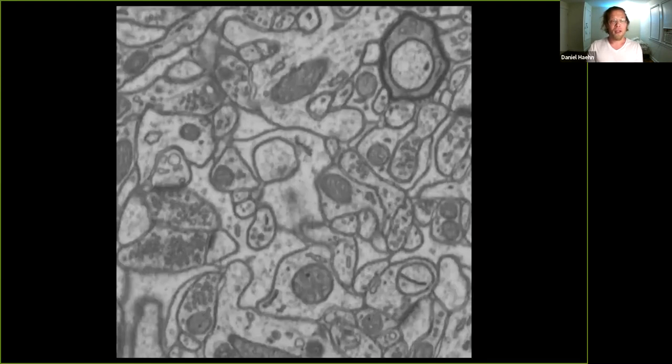With such high-resolution images, we see a wealth of biological information, but we are specifically interested in these dark circular structures that are mitochondria. Here, highlighted in red, with a variety of different shapes. And the task of automatically detecting mitochondria has been well explored. Most works use Lucchi's public benchmark dataset to compare performances. That dataset is also known as the EPFL benchmark.